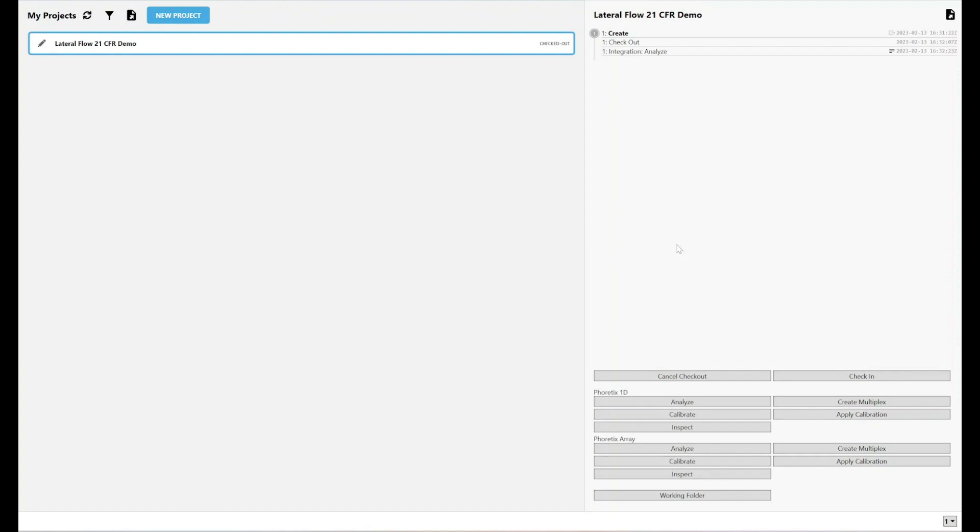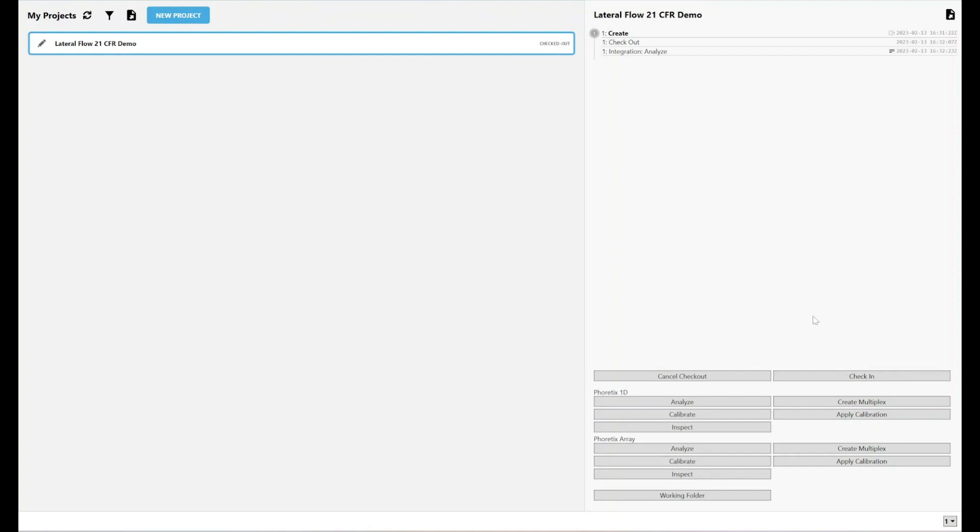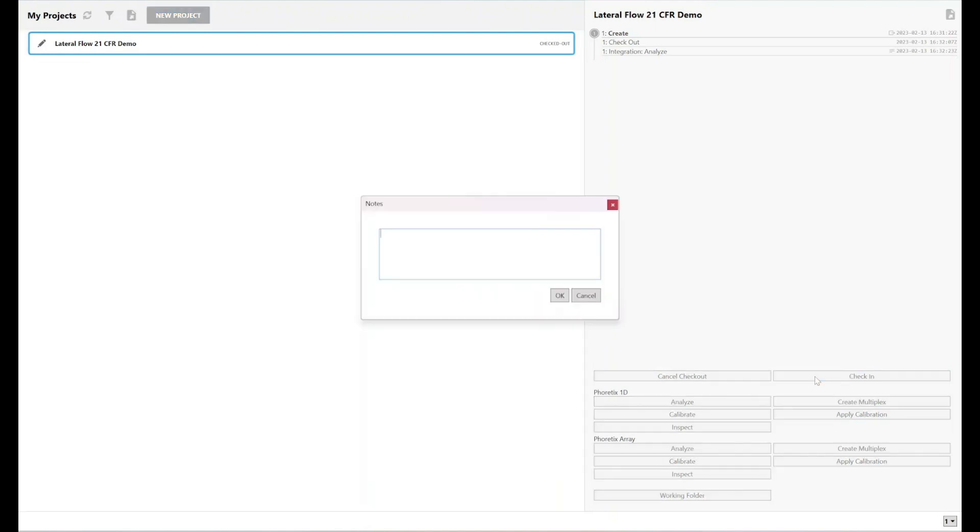I've still got the project checked out, which means that it's still in a temporary state. Until I check the project back in, it's in effect not saved, not secure, because it's still just a working copy that's on my computer. To put another copy of it into the secure folder, where it is stored securely, immutably, I need to just check it in.